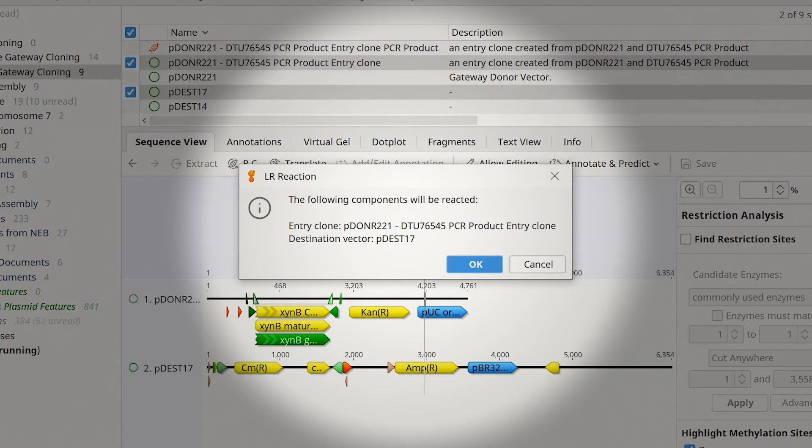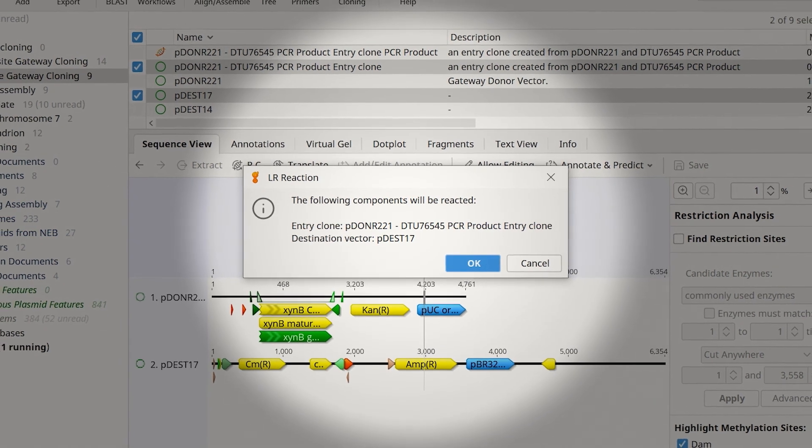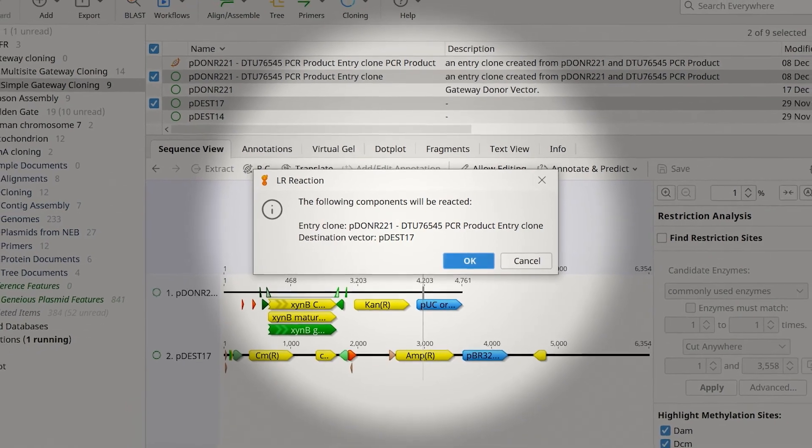In the next window, Genius summarizes the LR reaction being simulated. If you're happy with these settings, simply select OK.